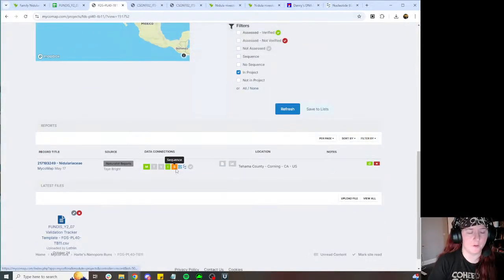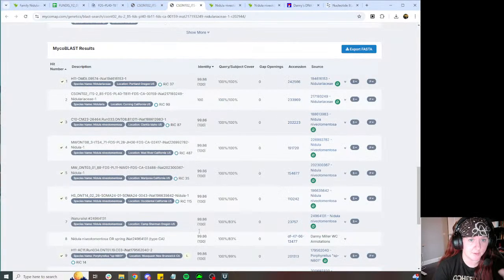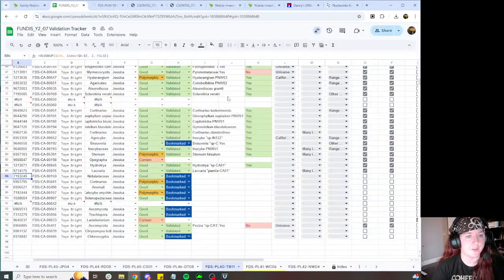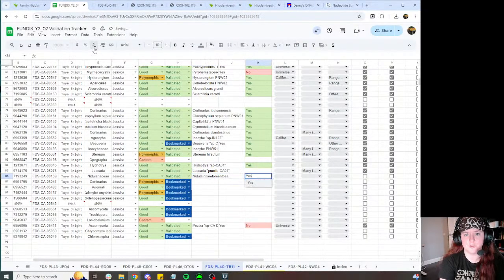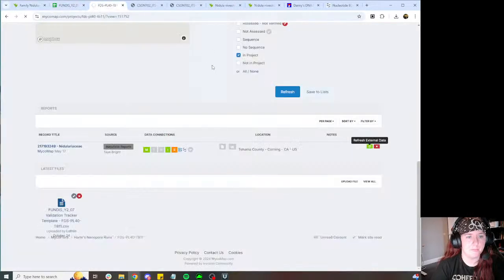Some of these I went through and already edited the sequences on, because it usually takes a couple minutes to do the new BLAST search. This is called a BLAST. So for my sanity, I usually go through and do the edits and then come back to them, so I don't have to sit there and wait for the system to finish processing. Those are pretty common.